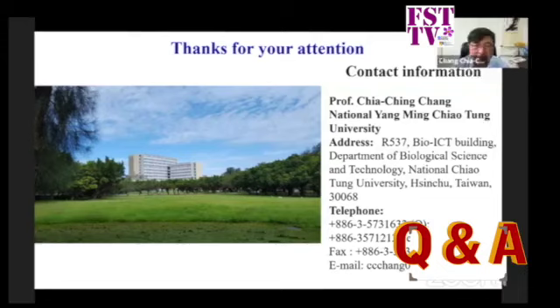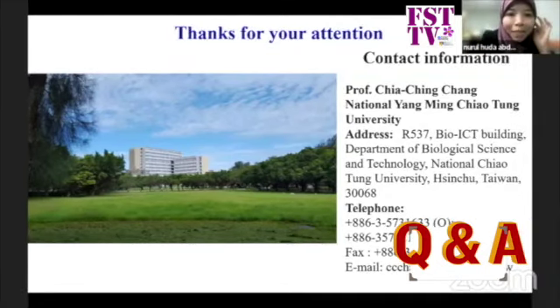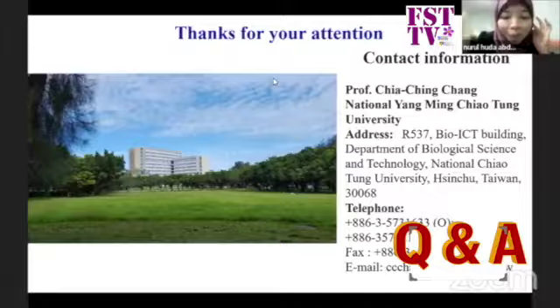I'm Nurul Huda from Universiti Kebangsaan Malaysia, in the same group as Dr. Izzati. Just out of curiosity, you're using a palladium nano film, right? Have you used other metals? Do they show a similar effect or similar efficiency? Or is there any reason why palladium? Okay, let me reiterate the question from Dr. Nurul Huda: you are using a palladium-based nano thin film for the construction of your biosensor, right?